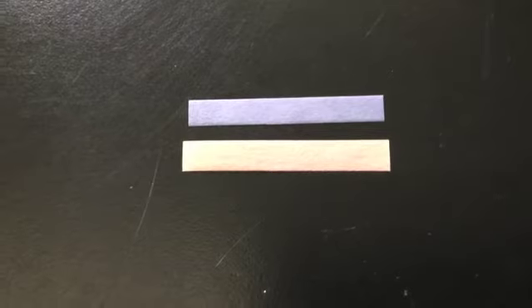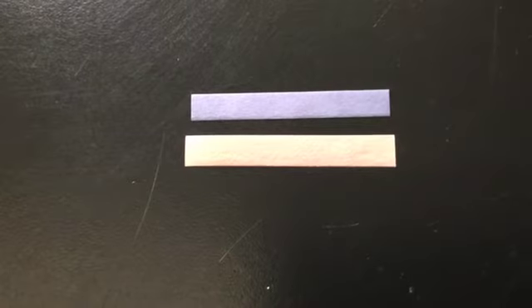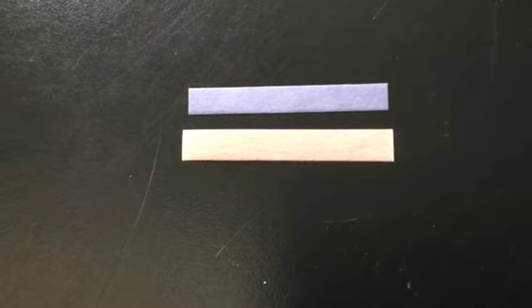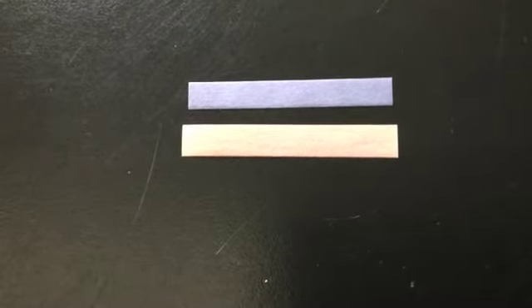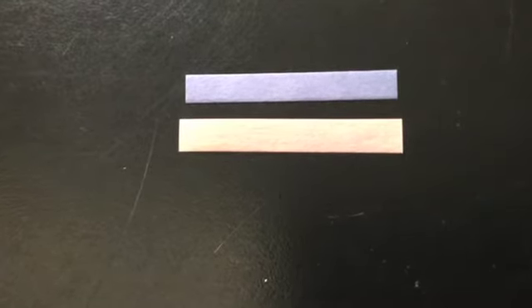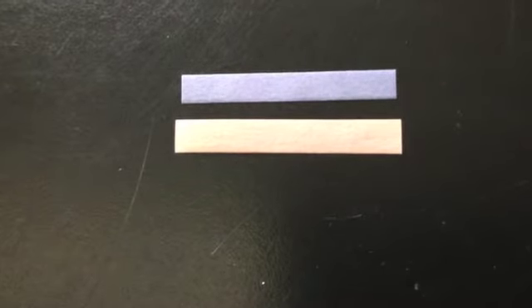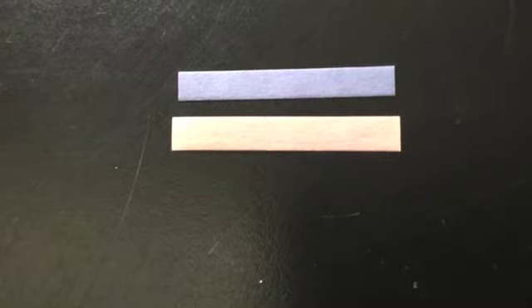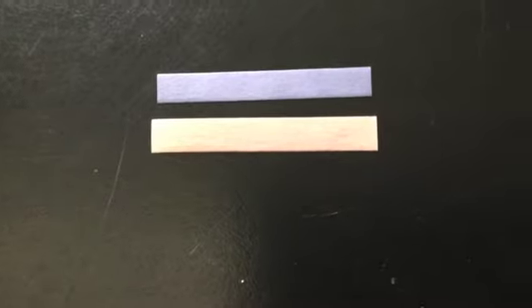These are strips of red and blue litmus paper. If you've never used red or blue litmus paper, you'll want to pay attention to this video to show you how to interpret what you're seeing. Red litmus paper often appears a pink color, and blue litmus paper may be blue or even purple in color. Red litmus paper will tend to stay in the pinkish range if it is in the presence of an acid, but it will turn blue in the presence of a base. Blue litmus paper will stay blue in the presence of a base, but will turn red in the presence of an acid. In either case, blue means base and red means acid.